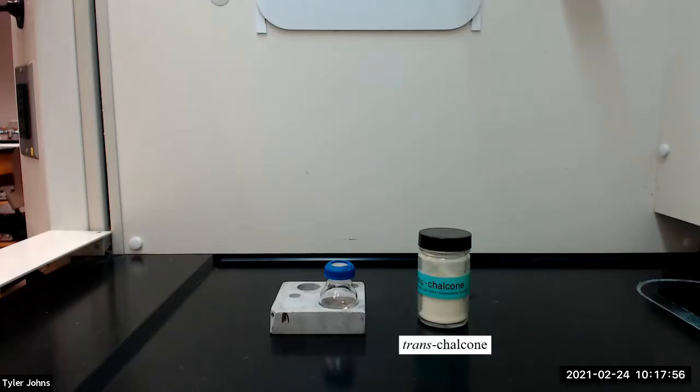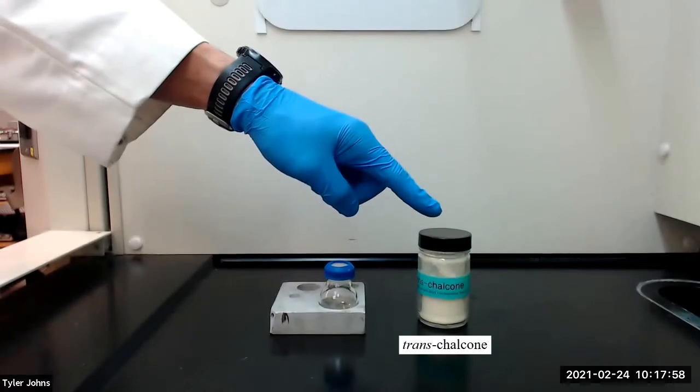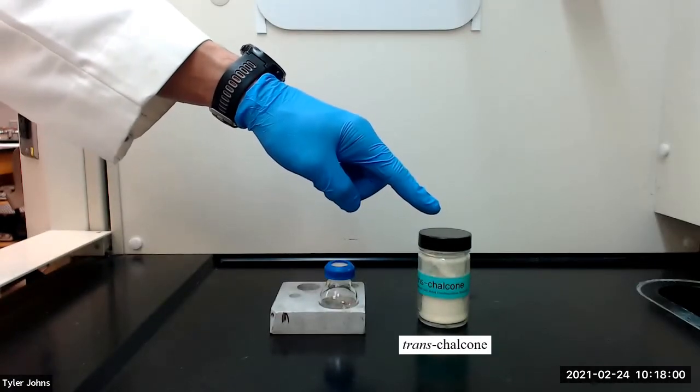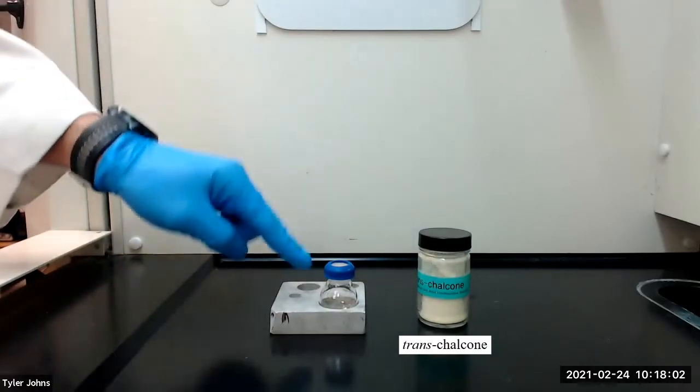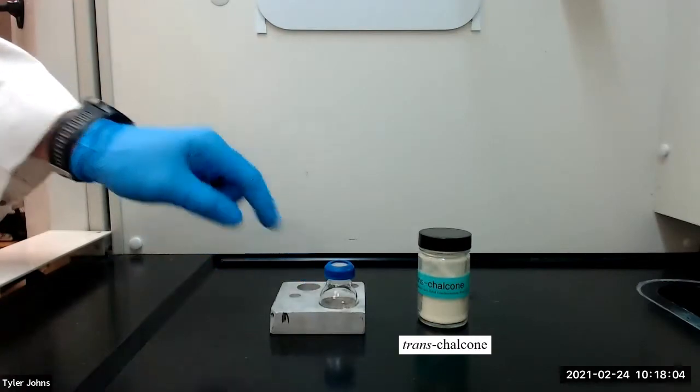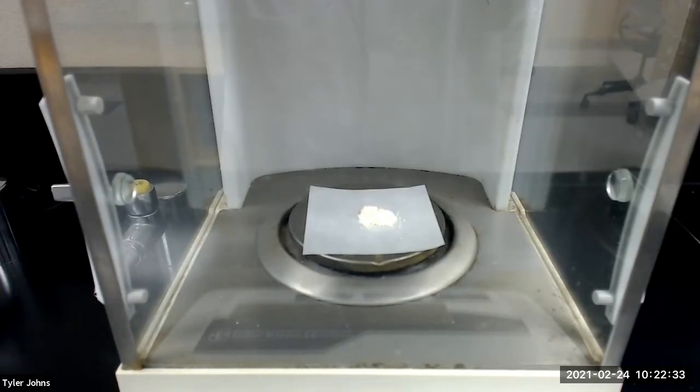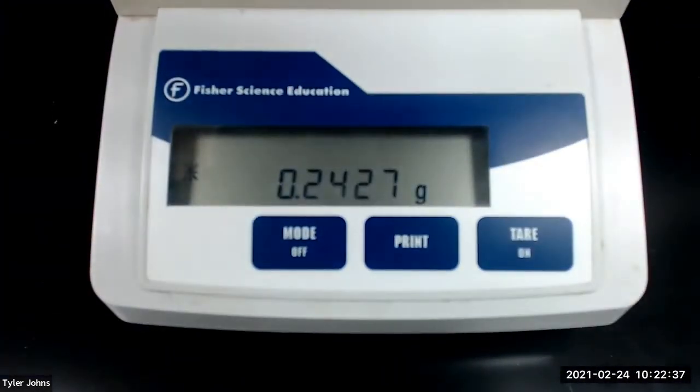Let's get started. We will begin by adding 0.24 grams of finely ground trans chalcone to a 10 milliliter round bottom flask. The mass of trans chalcone that we will be using is 0.2427 grams.